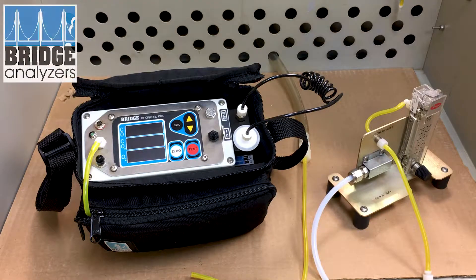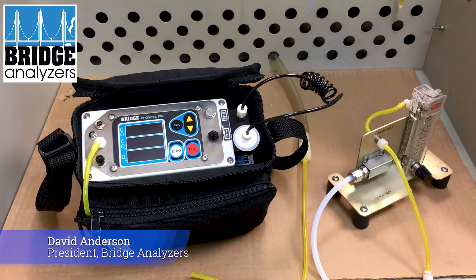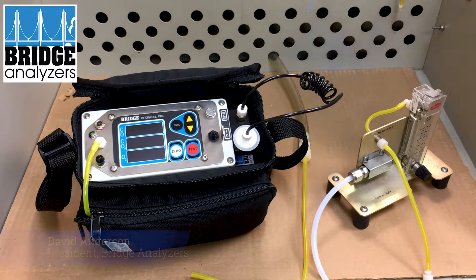Today we're going to take a look at the Bridge Analyzer's tri-gas calibration. We're going to calibrate using a gas mix of 30% CO2, 0.4% CO, and balanced nitrogen, which would give us 0% oxygen.